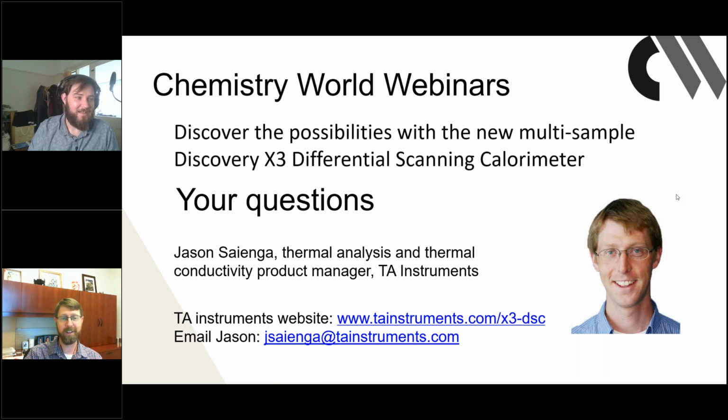I hope that answers your question. Well, it actually leads us very neatly, and Pintu clearly knew what they were doing here. It leads us very neatly into Pintu's second question, which is, what's the normal scanning range and what's the maximum temperature?